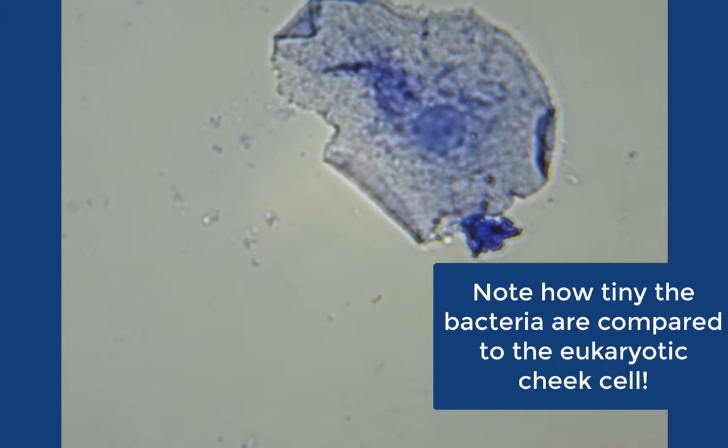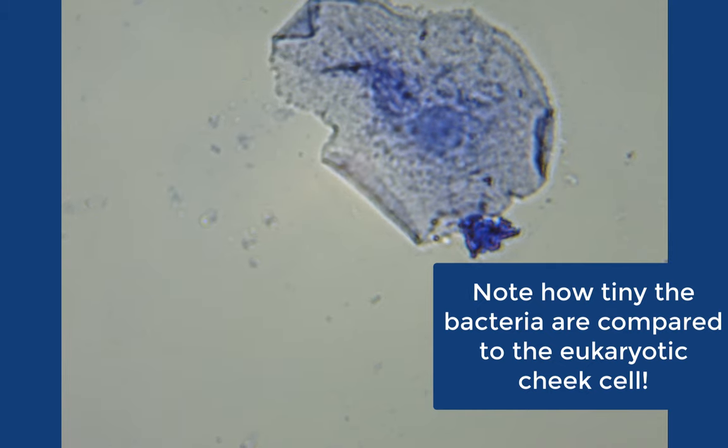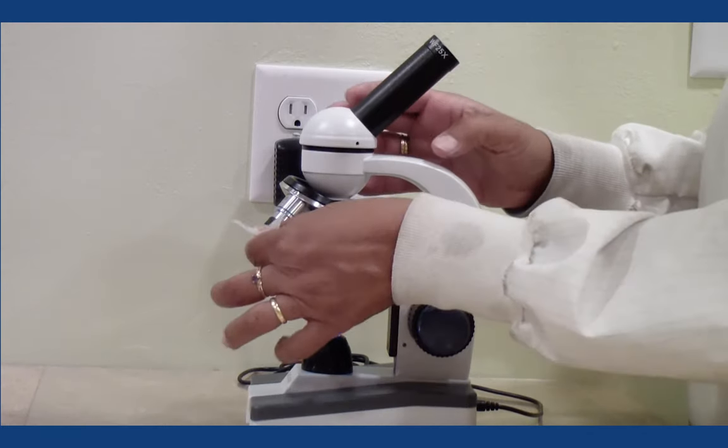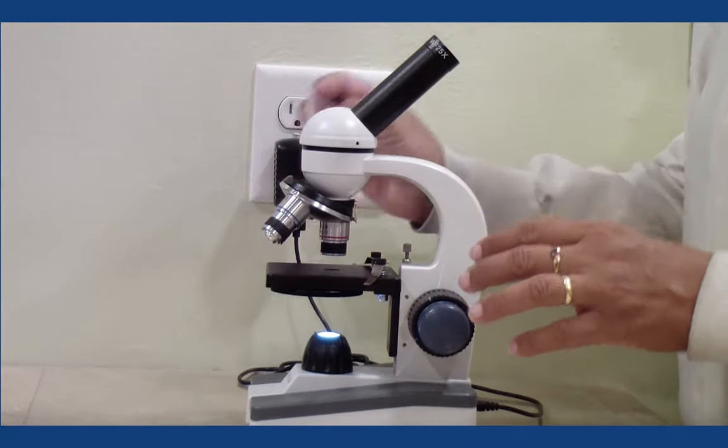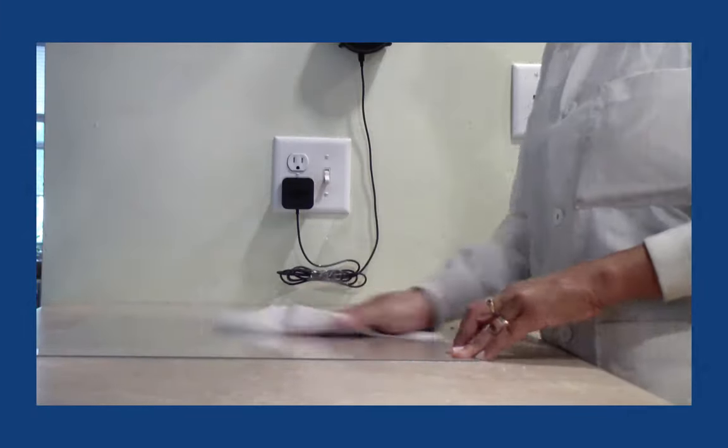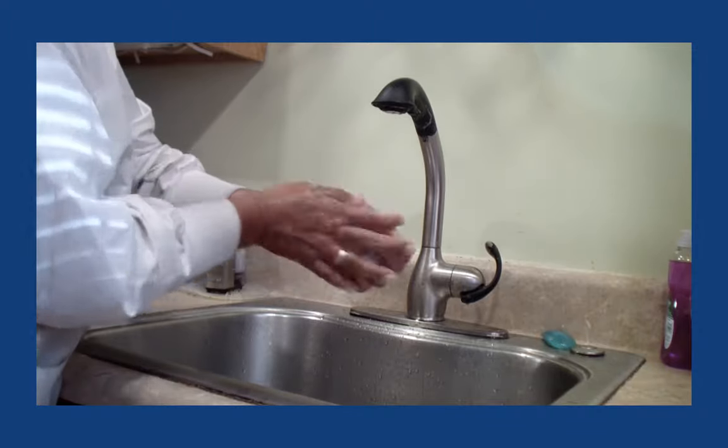These are the bacteria that normally live in your mouth. Don't forget to take some pictures for your lab quiz. When you are done, wipe the lenses off with a small piece of lens paper. You may wash your slide for reuse. Clean up by wiping your bench off and washing your hands.